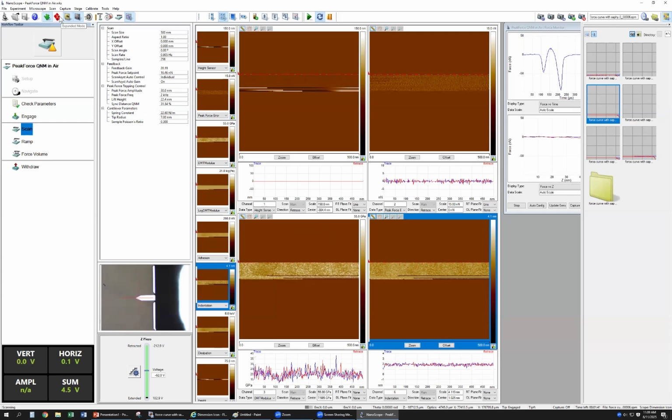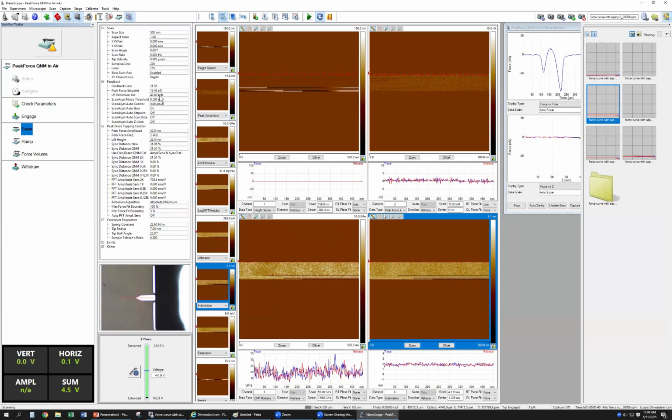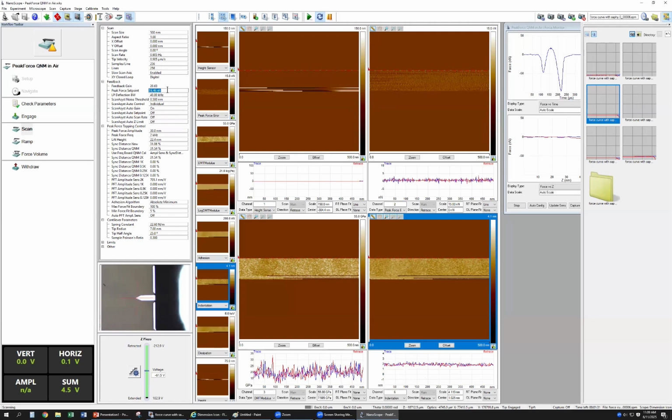Okay, we go to the extend module. You adjust this force. Make this value bigger than 4, sometimes it should have 4. Then you adjust this force to make this one bigger.